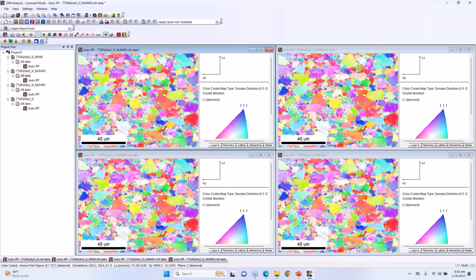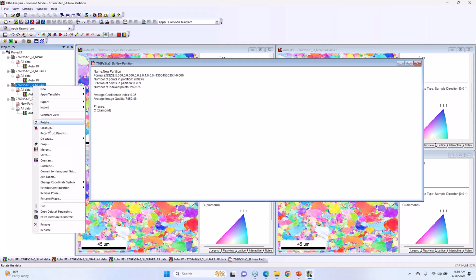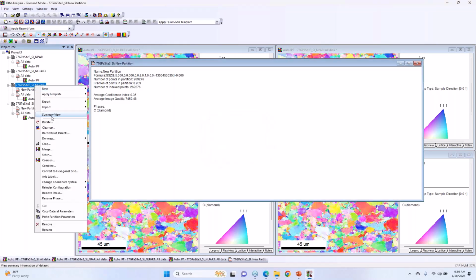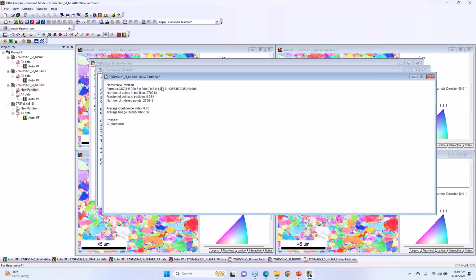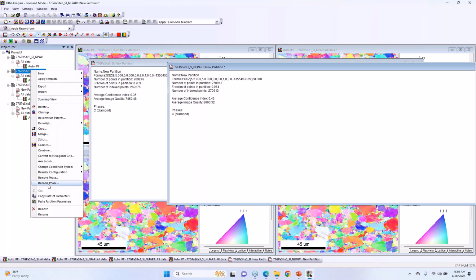You can stare at those and try to see what the difference is. And again, if we put in our partition grain size 5 or larger, that's the 96%. I can just copy and paste these over. So this is with that, about 96%, so not a huge difference with NLPar there.